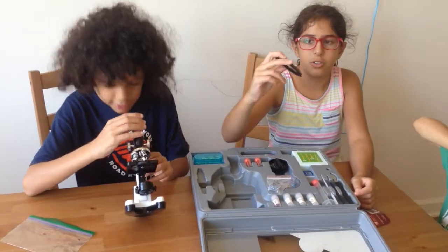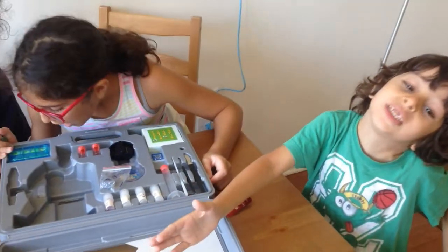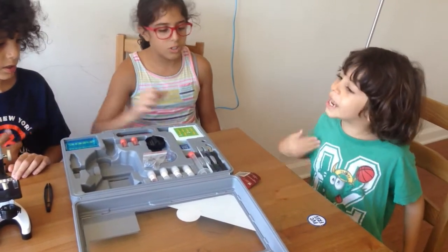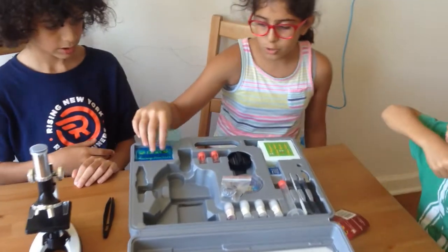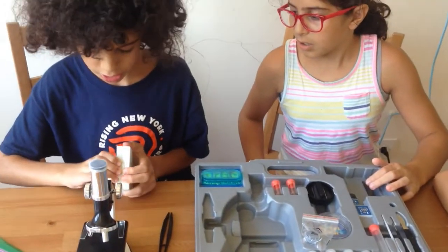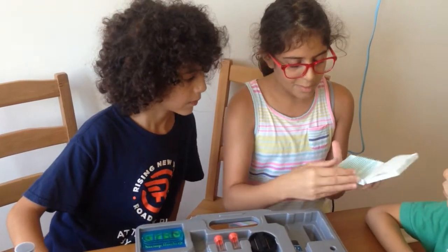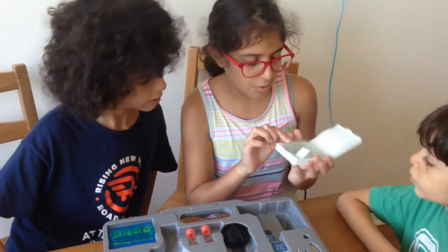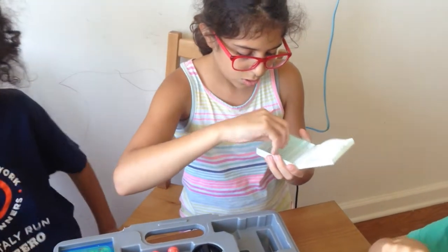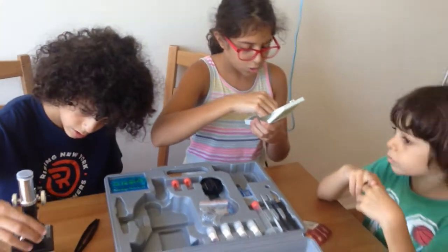There are tweezers. I don't know what this is. There are some shrimp thingies, and here is where you could put other things. They already put in stuff so you could test that with the microscope. That's like glass slides — some of them are blank for you to make your own, and they made some of them, like corn root and onion bulb. Here are some of the things that they made, and it comes with a blank slide so you can make your own.